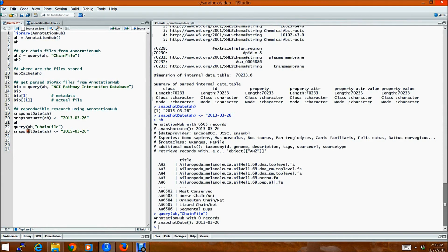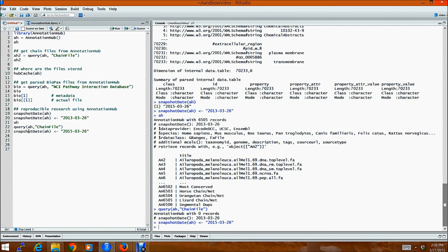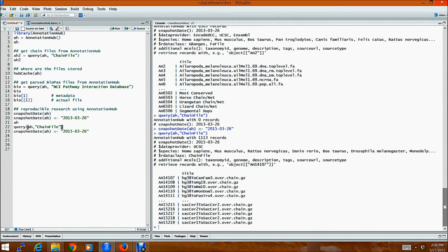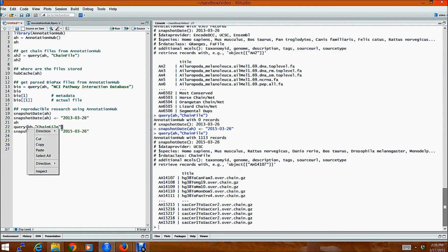Now, if I again set the AnnotationHub for today's date and look at these chain files again, then you can see that the chain files are returned to me. So in this way, one can use AnnotationHub to do reproducible research.